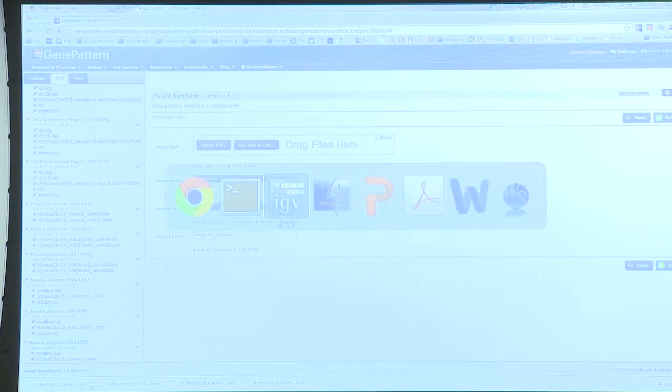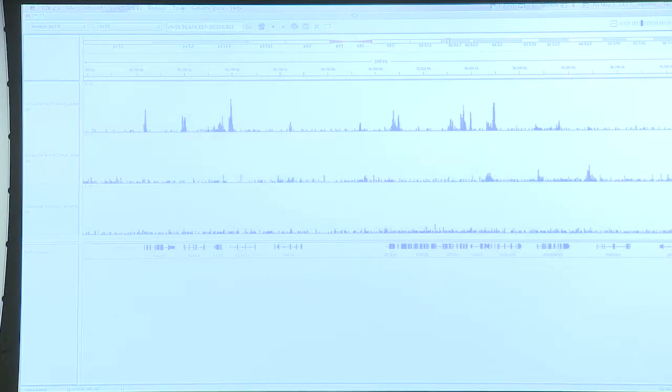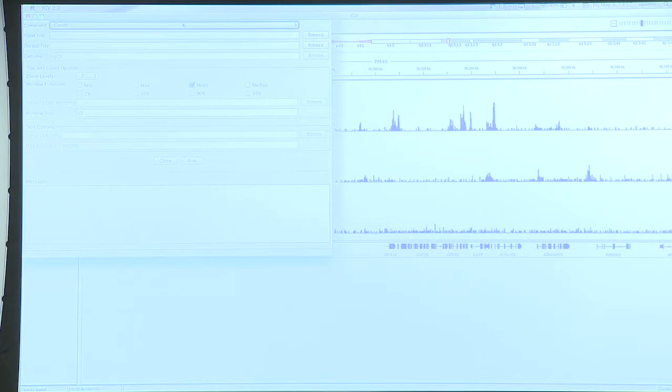The next step will be to go to IGV. Once I've opened IGV, there is something called tools. I go to Run IGV Tools, and from Run IGV Tools, it asks me to browse. So I browse the one that I've just generated, which is in here. I click on it, and it's going to name the TDF file the same name, just adding TDF at the end. And I run. Since it's only one chromosome, it takes pretty quickly. Usually it takes a bit longer.